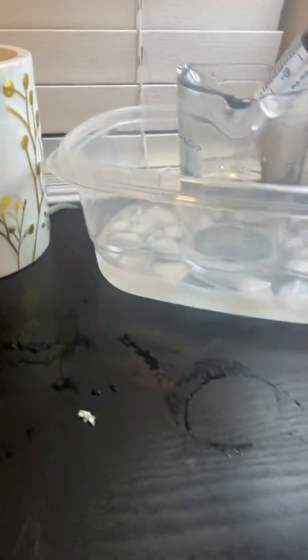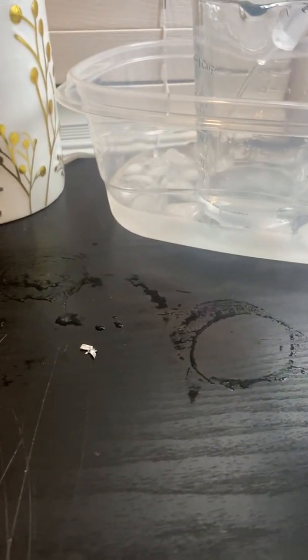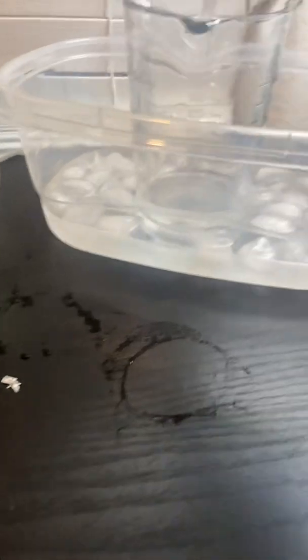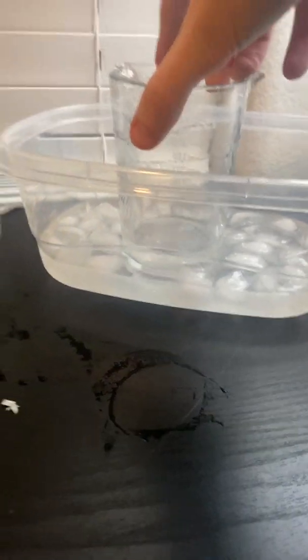we will add 10 milliliters of this 50-50 ethanol water solvent. This will purify the alum crystals. It should be white and fluffy at the end.